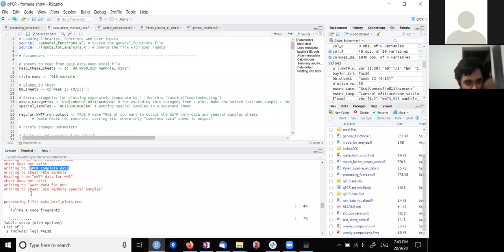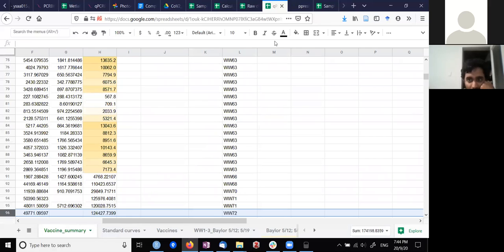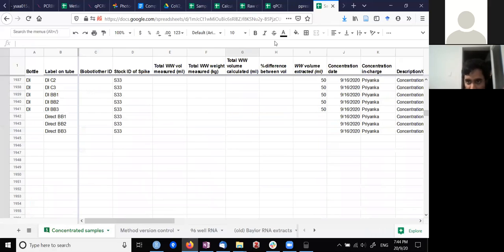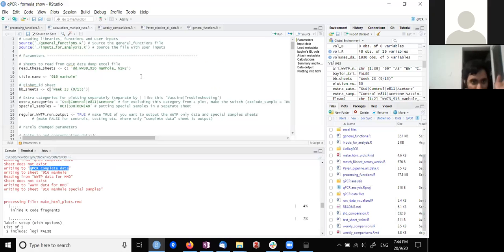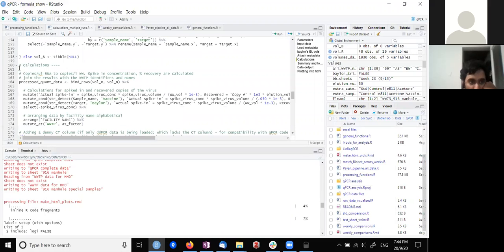When it has gone through all of this data, it collects them all together. Then it does the calculation. So it divides by the volume and it does some other things. It takes the vaccine ID that we give it, and then it takes the amount of quantification that we have for that, and it accounts for that. It does some normalization. A lot of things are happening here. So the information will be in this. When I write my code, I try to divide it into segments, and that way you can access it easily through that button there.